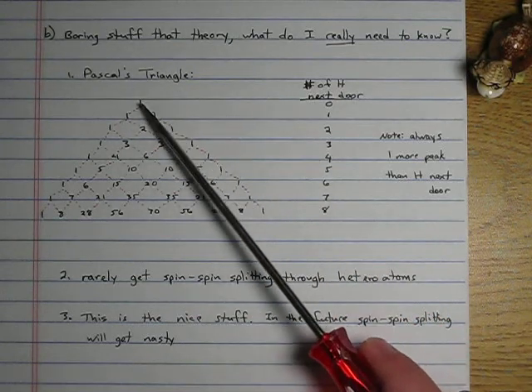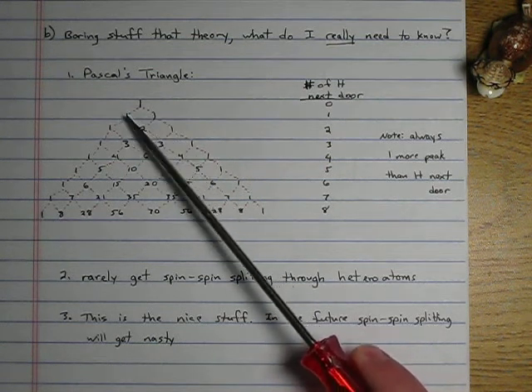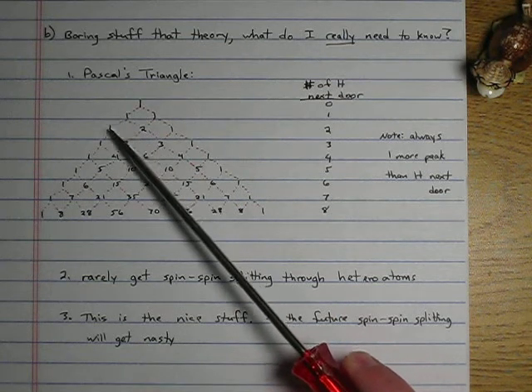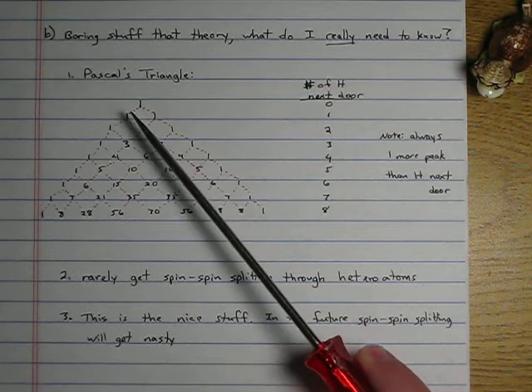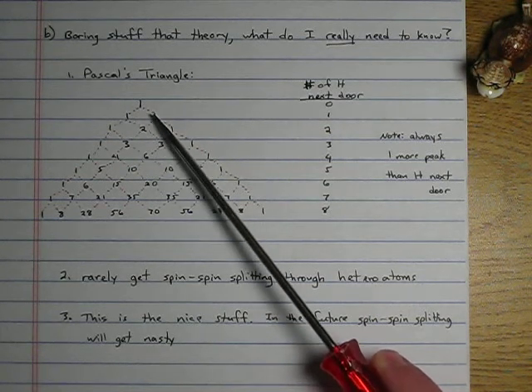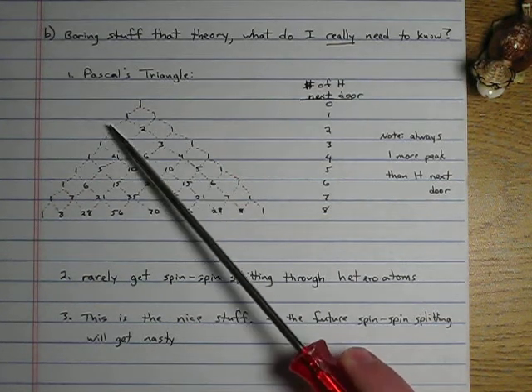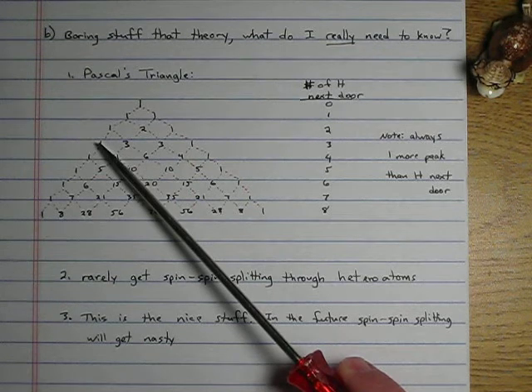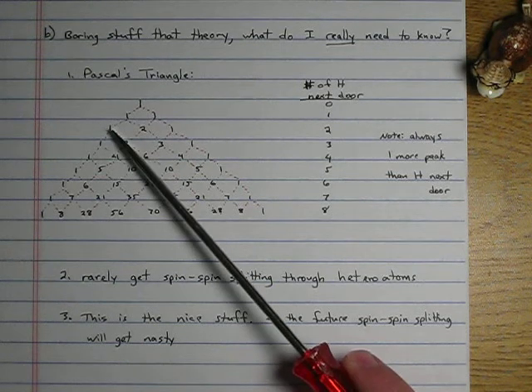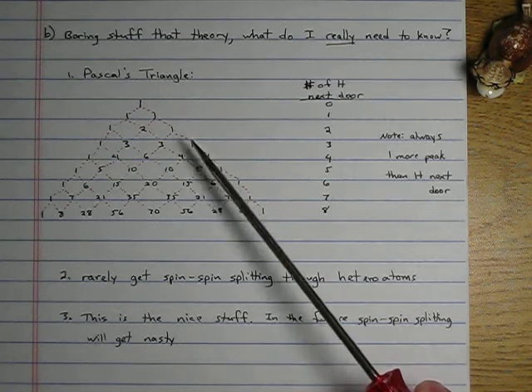If you start with 1 and you split that down into 1 here and a 1 there, what you're always going to do is split this down into 1, because going down this way there's nothing else, so this is just a 1 here. But if you go down this way, note these two can both come together, so this is 1 plus 1 is 2. And this 1 comes down. So the next line, the 1 comes down. This is 1 plus 2 is 3, 2 plus 1 is 3, the 1 comes down.